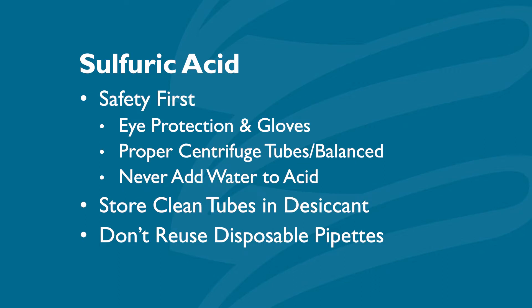First and foremost, remember safety first. Wear eye protection and gloves at all times when handling the acid. Ensure that you're using centrifuge tubes and not just test tubes, and make sure the centrifuge is properly balanced when in use. Never add water directly to sulfuric acid — only add acid into water. Keep your centrifuge tubes in a container filled with a desiccant to reduce moisture, and never reuse disposable pipettes, as trace amounts of water left in the pipettes will skew your results.